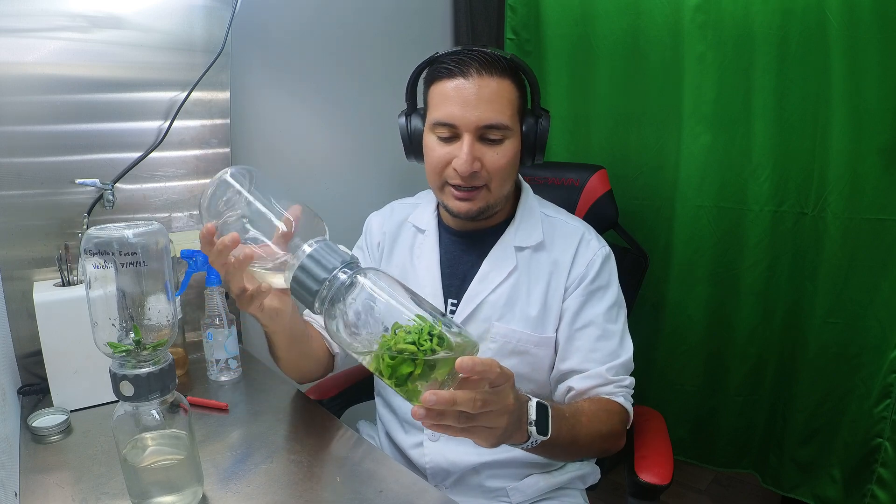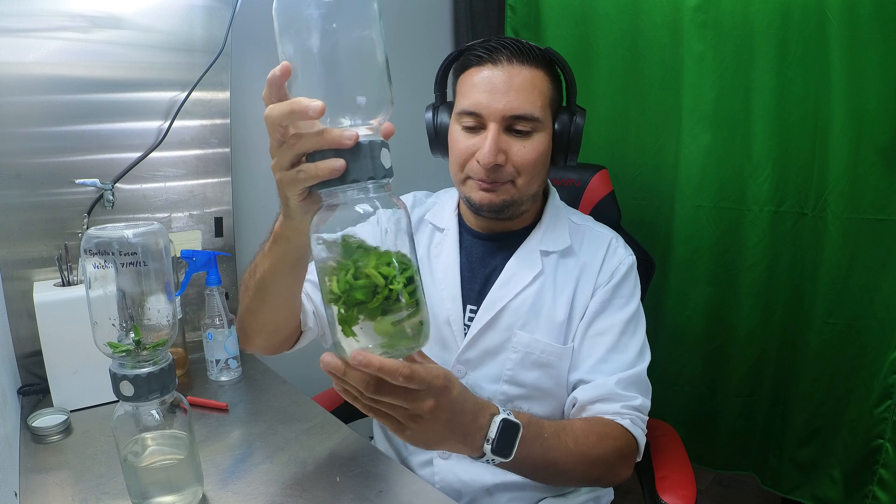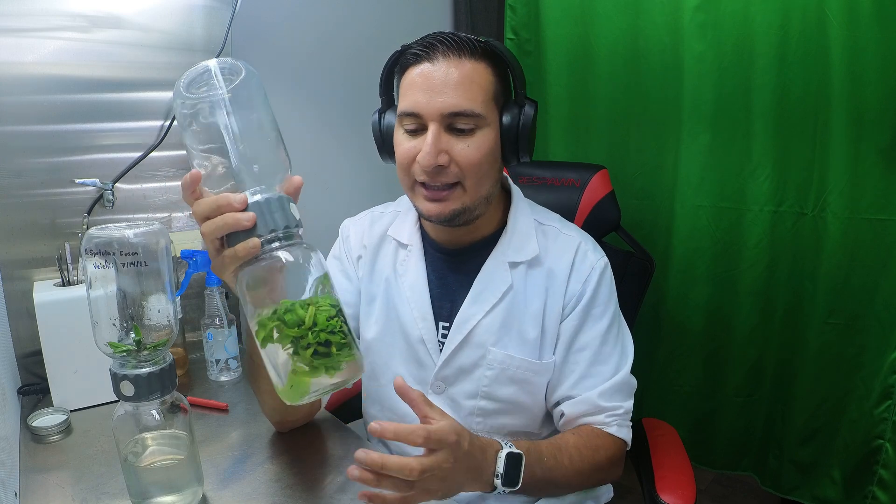Pretty much everything is done — I moved the plants into the bigger 32-ounce biocoupler and it looks much better now with a lot more space to grow. At this point I could have taken some of these plants and rooted them in sphagnum moss, but I still want to keep going and see how many plants I can get. This is the biggest size biocoupler I can use, so I want to see how big these clumps get.